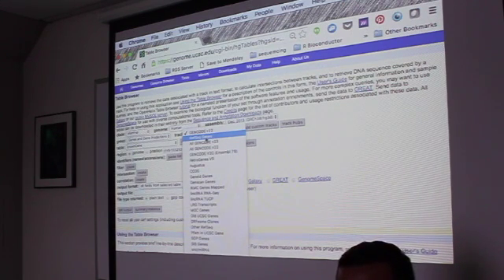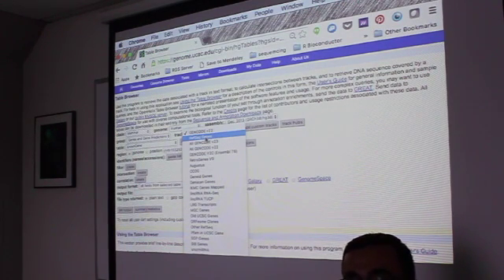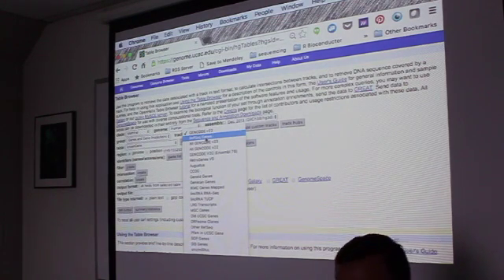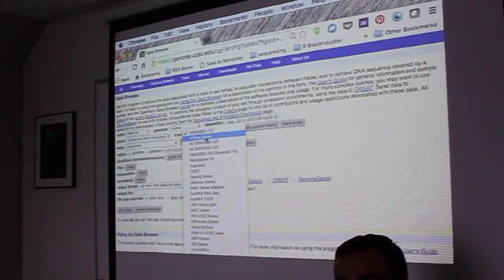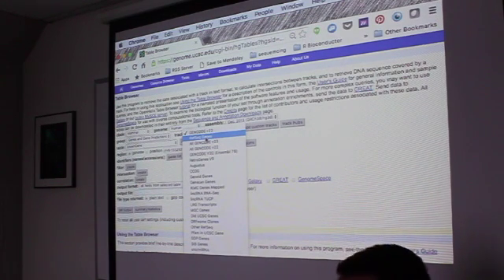Sorry, are these a genome assembly, like the entire genome, or is this just the transcriptome? No, this is the way the genome has been divided and presented into their specific IDs. The genome sequence is defined as a consensus. That is hg38, which you have downloaded as the FASTA file, and it's already there on our server. But then the next step is how do you quantify into units? Where is the coding sequence, and which ID do you define this as? Basically, how do you present the genome? That's a good way to put it.